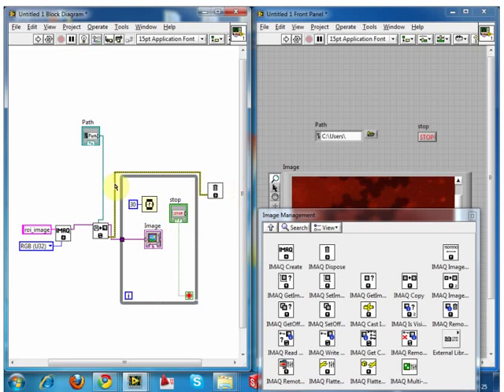What we want to do is route it through the loop. So then it can't do it until the loop has finished. So now, because it runs in sequence, this cannot start until this has finished. So we have to say stop before it will destroy the image. So now we have no competition. I'll show you how to do it.